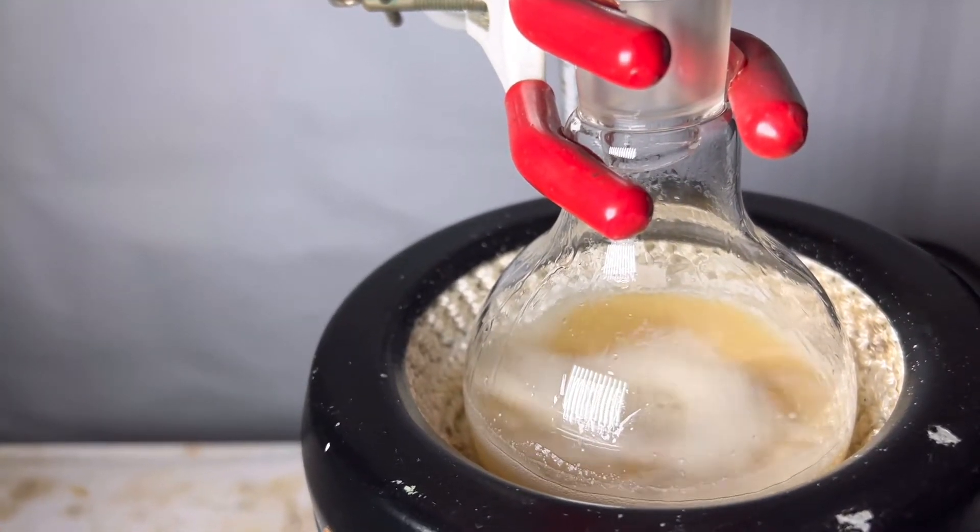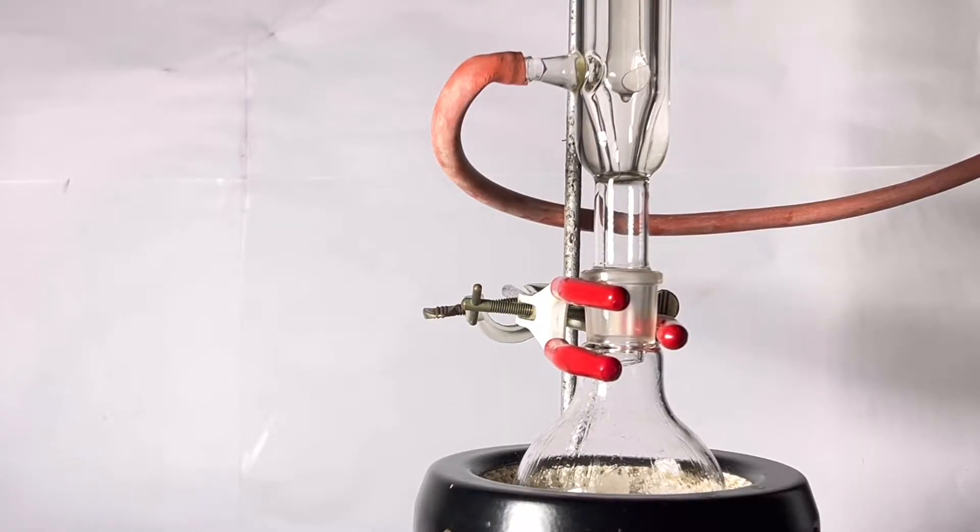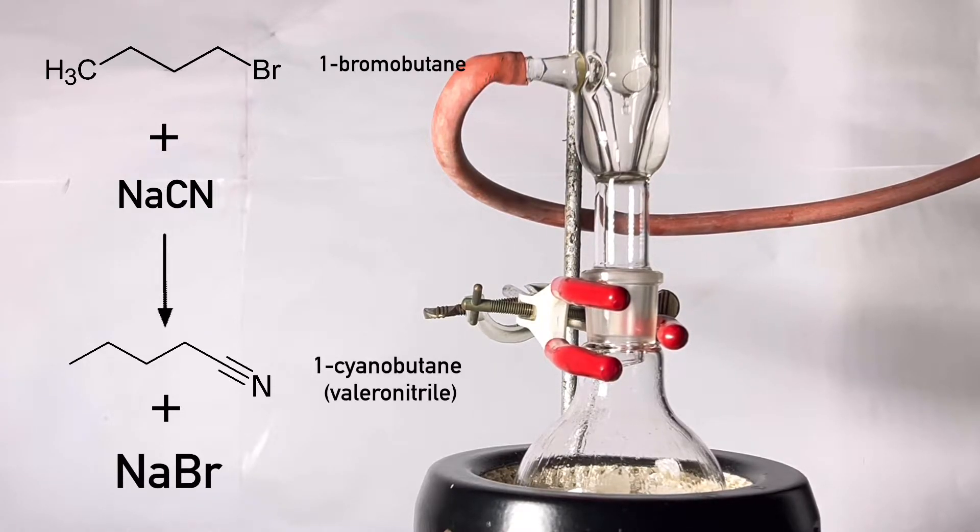Now let us see the reaction that is taking place. Here a substitution reaction takes place where the bromide ion of the alkyl bromide is substituted with the nitrile ion, also known as the cyanide ion, to form valeronitrile, also known as n-butyl cyanide, and sodium bromide is also formed as the side product.